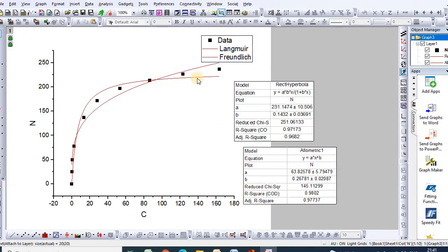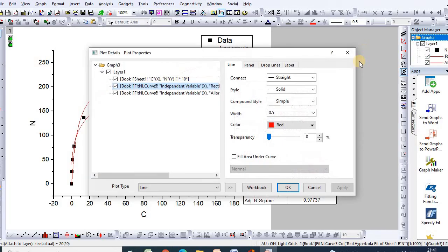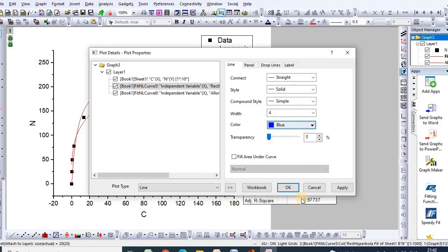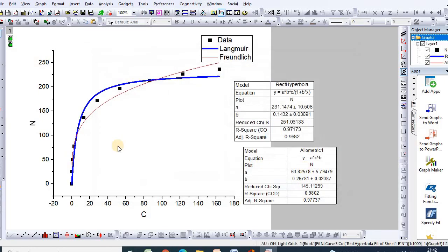You can recolor the plot using different fonts and colors, and you can also rename the curves. This is how we can easily fit the Langmuir and Freundlich equations in OriginPro.